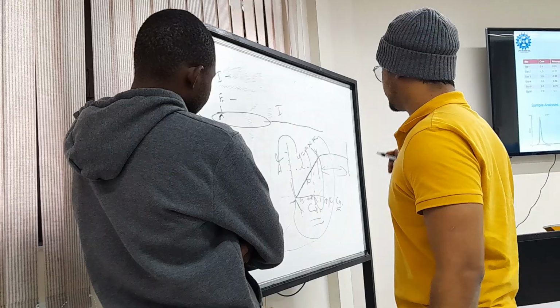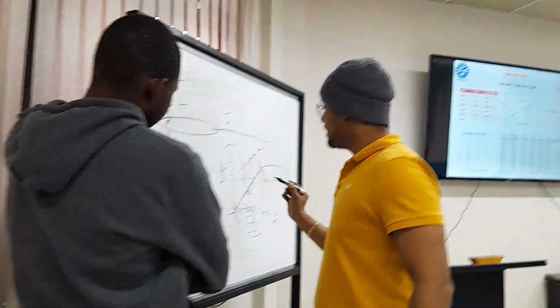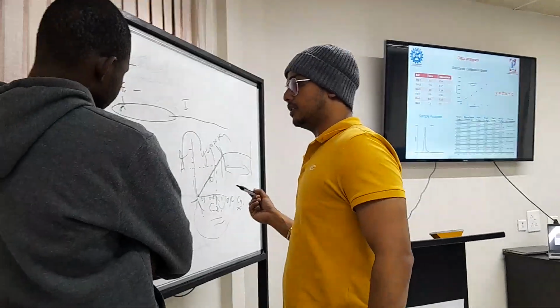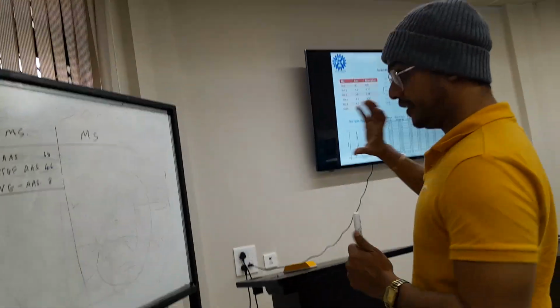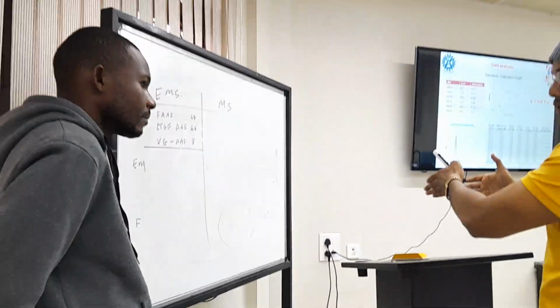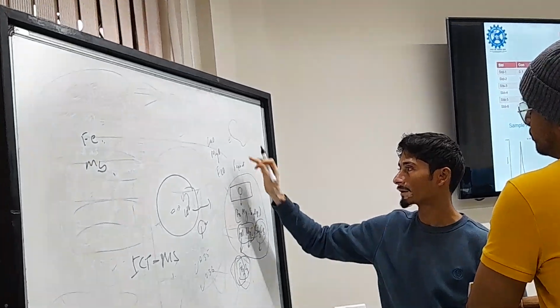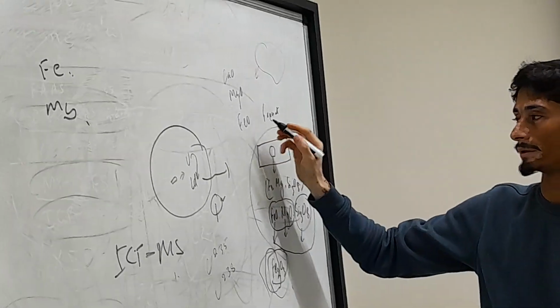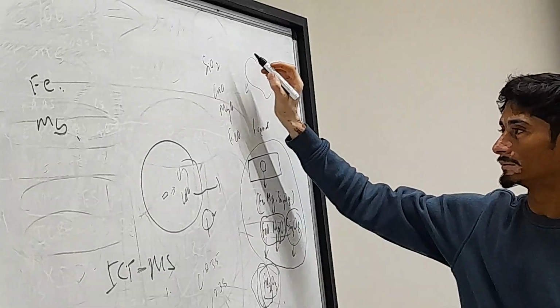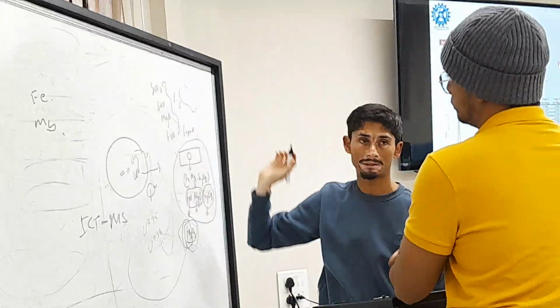And when he speaks about detection capability, it is the ability to detect here. Each element within the periodic table, you just switch out the atomization. Where there's a flame, you take out the flame and install the graphite furnace. Then there are calcium, magnesium, and iron oxides, and some others like silica. Each of them is on a percentage scale.